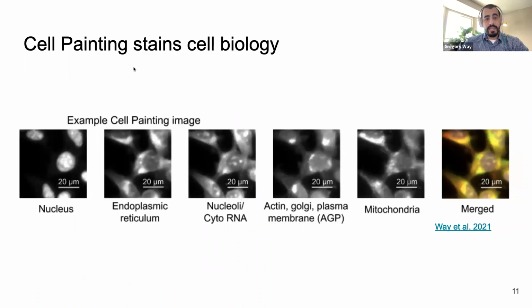So the traditional cell painting assay is going to stain for these specific cell compartments. So we have a nucleus channel. We have a channel that targets endoplasmic reticulum, nucleoli and cytoplasmic RNA, actin, Golgi, plasma membrane, or AGP, as well as mitochondria. And so typically when you see the cell painting assay, it'll be merged into a single representation across the different channels. But know that these are individual reagents that we're using to stain independent cell painting compartments. The cell painting assay is also really customizable and not really all that much optimized. So there's lots of room to improve the assay and lots of flexibility to be creative.